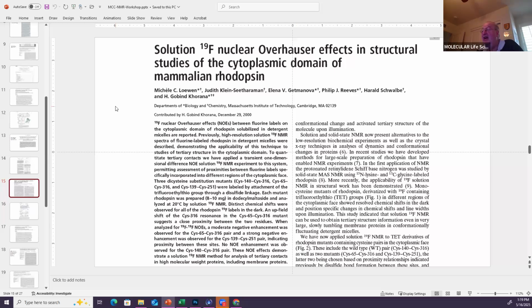The other thing that I always do is give them a problem set with a 2D spectrum and get them to work out all the cross peaks and try to come up with a structure from the spectrum. It's a relatively small peptide that forms an alpha helix, so they see what an alpha helix 2D pattern looks like.